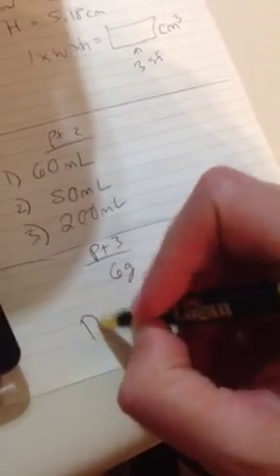So I'm going to write down my initial volume, which was 50, and my final volume, which was 58, which means that the black-eyed peas had a volume of 8 milliliters.